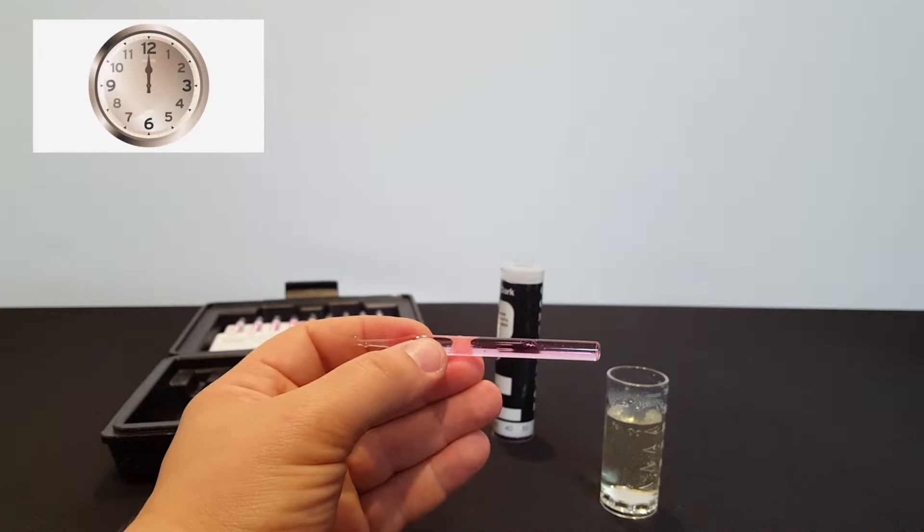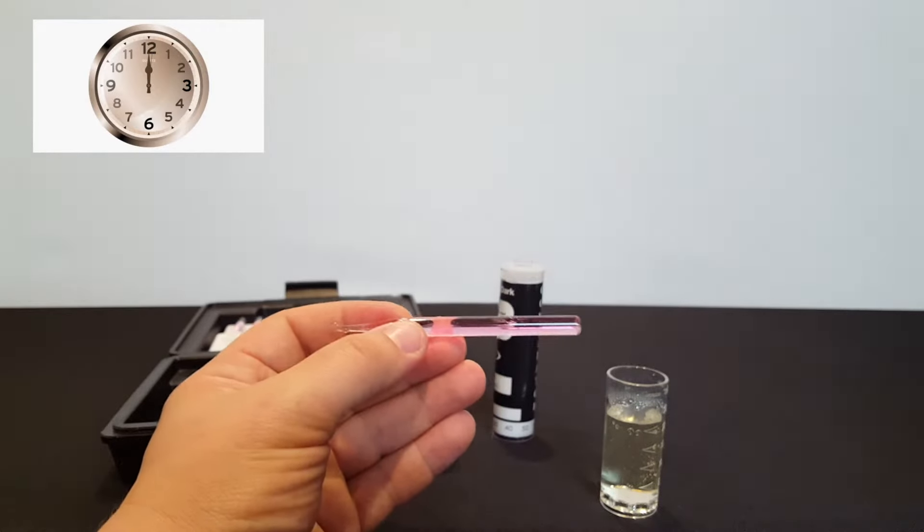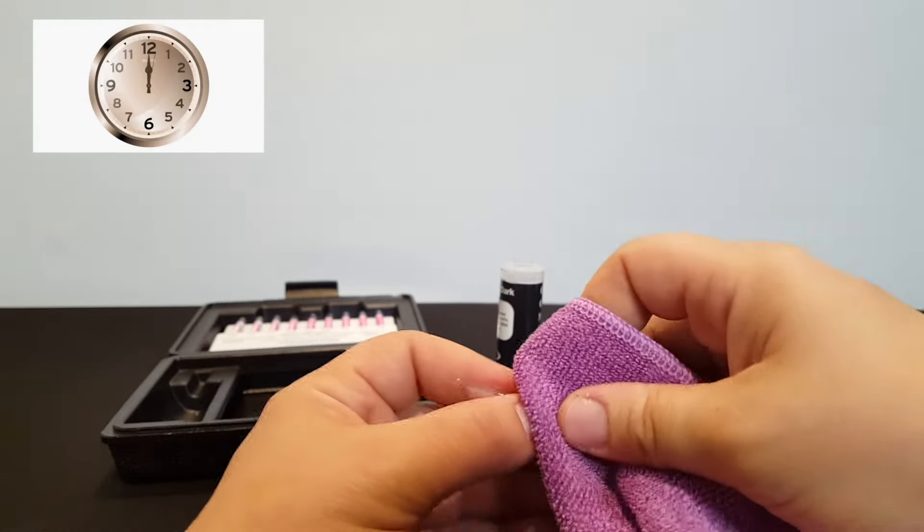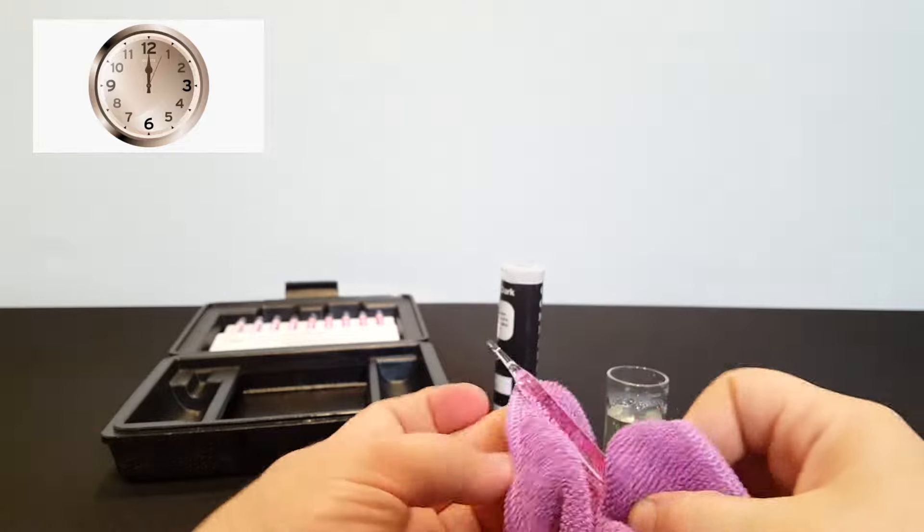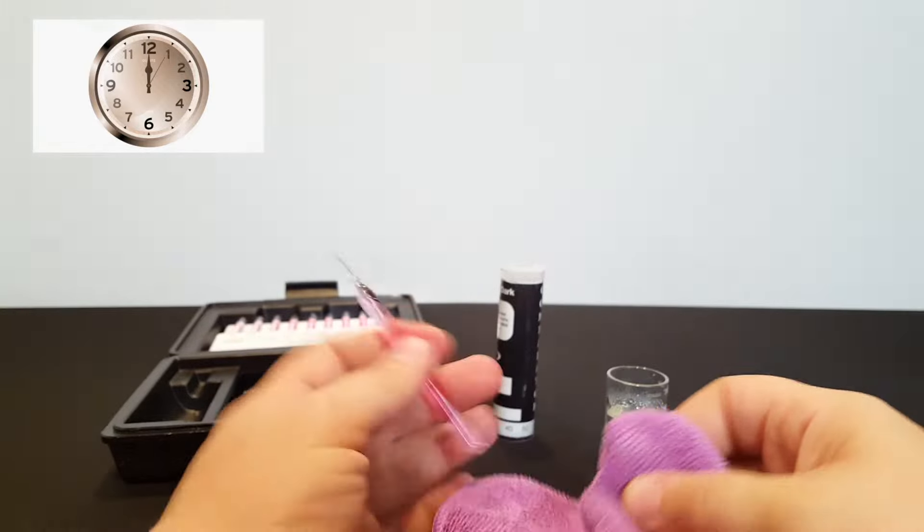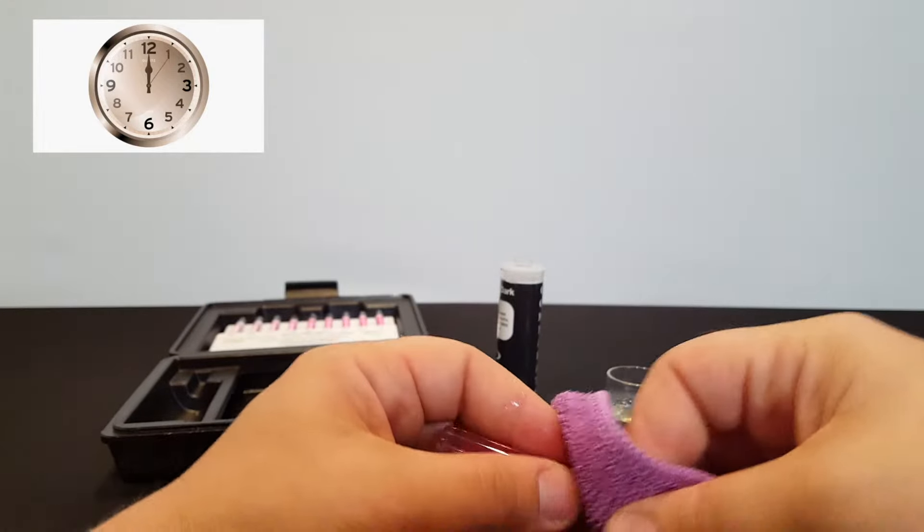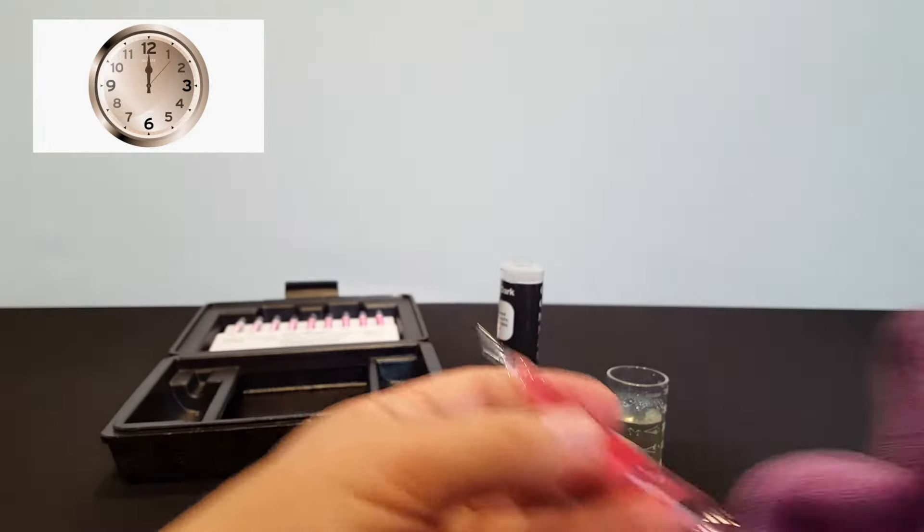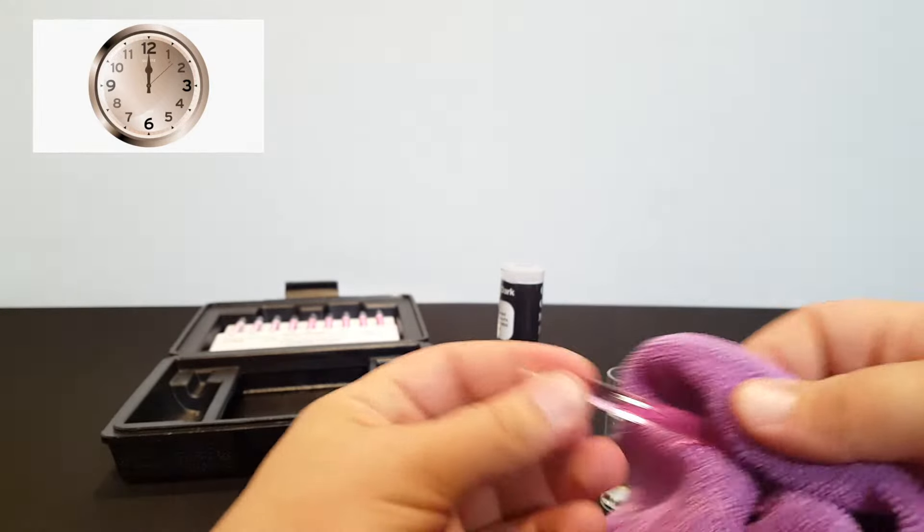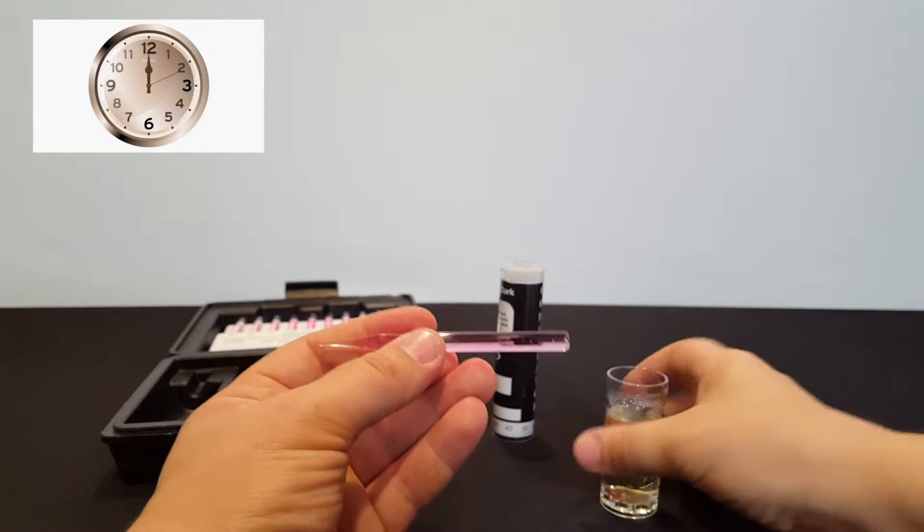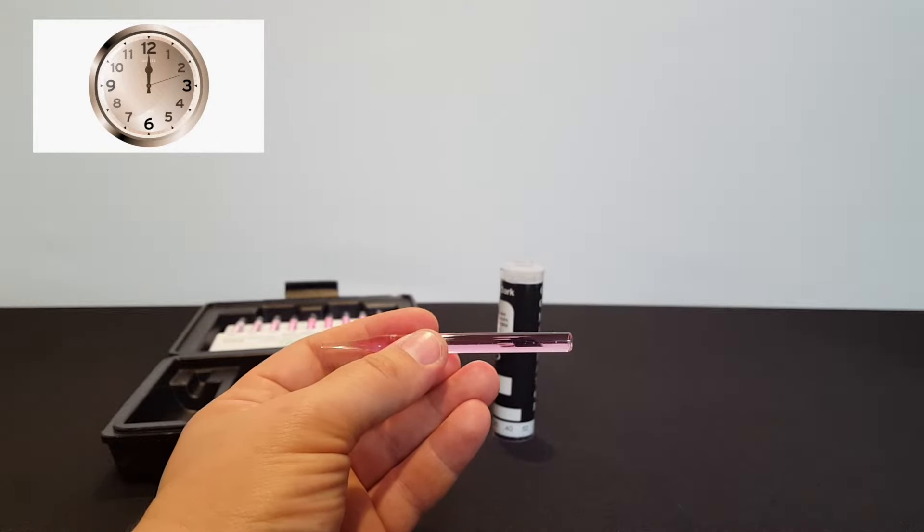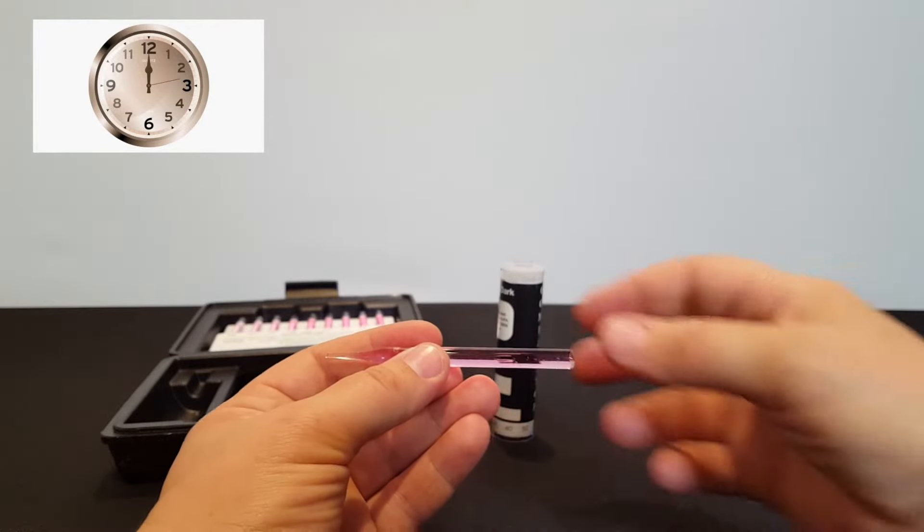And then you wait one minute for the color to develop correctly. You can go ahead and dry it off while you're waiting because that will allow it to be easier to see the color of the pink after the test is fully developed.